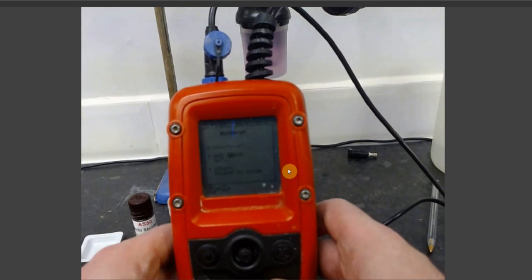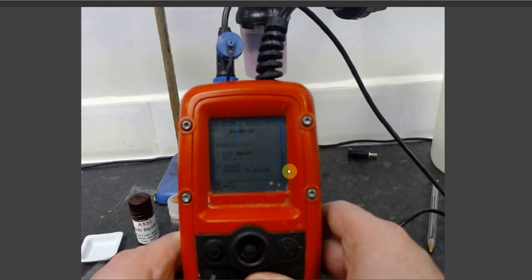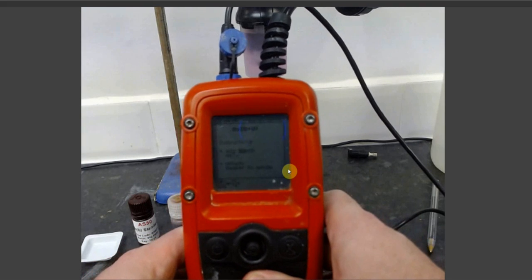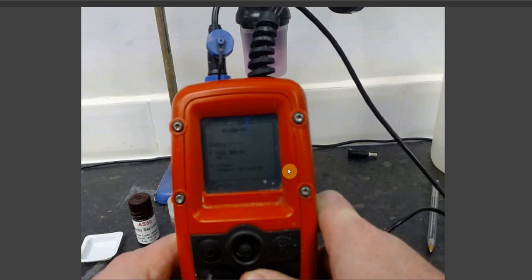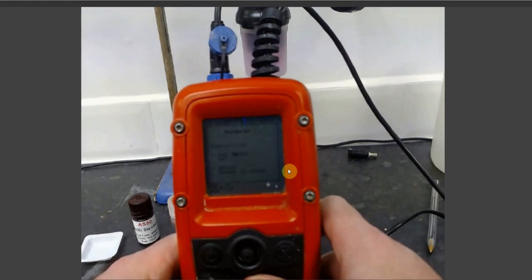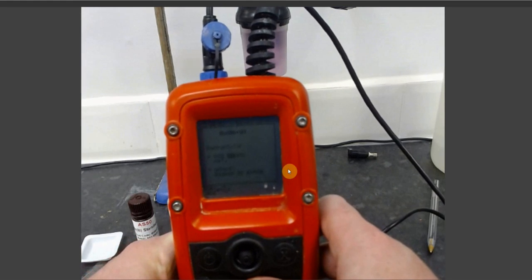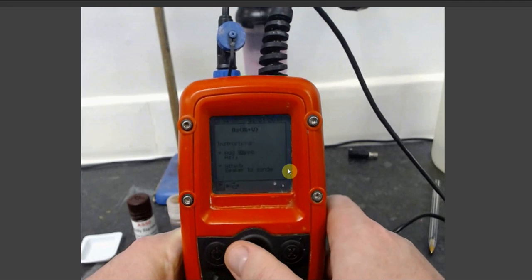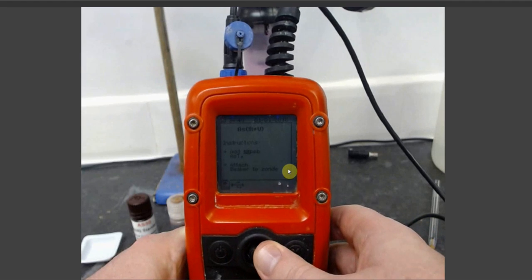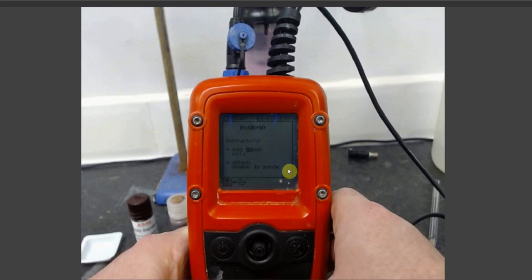Once your Metalyser has finished the first voltammogram that it requires, it will prompt you to make a standard addition. The default standard addition is 20 parts per billion. This is if you have no historical data and no expected concentration. If you have either of these, it is best to use a standard addition that closely matches the concentration you are expecting to see. This can be changed on the Metalyser by pressing sideways on the trackpad to alter the parts per billion added.